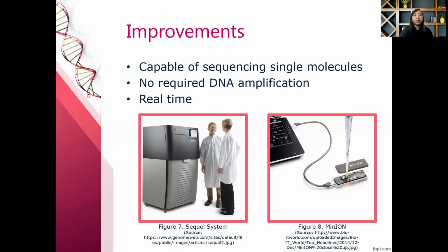And then the next advantage is speed. Next generation sequencing is quicker than standard sequencing in two ways. Firstly, the chemical reaction may be combined with the signal detection in some versions of next generation sequencing, whereas in standard sequencing these are two separate processes. Secondly, and more significantly, only one read can be taken at a time in standard sequencing, whereas next generation sequencing is massively parallel, allowing 300 gigabases of DNA to be read in a single run on a single chip.